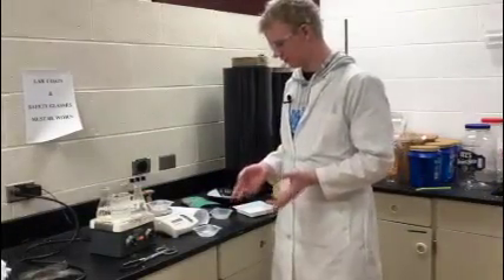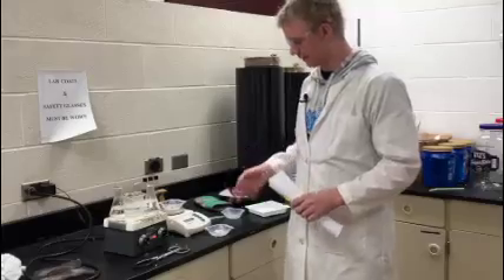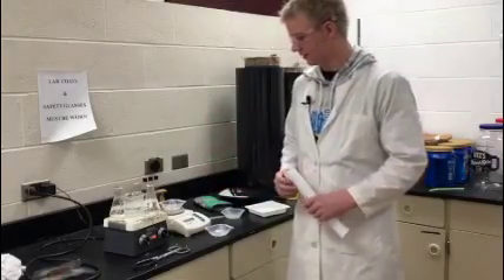Once you've got all your 12 grams massed out — three samples massed out — you are going to use a paper funnel to put the pellets into an Erlenmeyer flask for one hour.